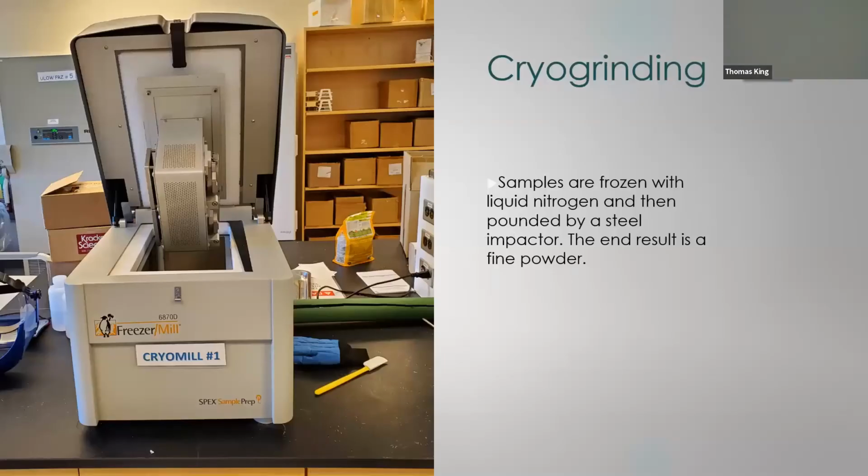Here's a picture of the cryo grinder that we use. The samples are frozen with liquid nitrogen and then pounded by a steel impactor. The end result is a fine powder. This is very useful when we're having to grind sticky candy or having to deal with whole spices like whole turmeric roots or whole chilies.